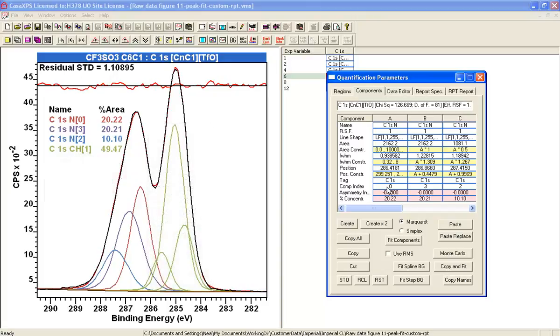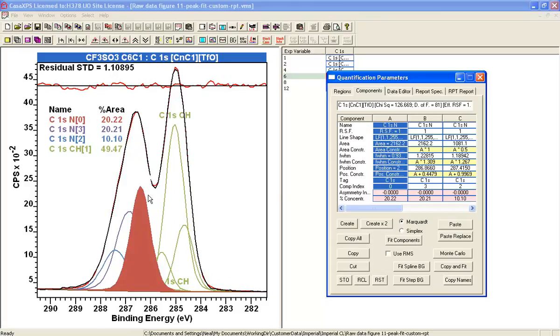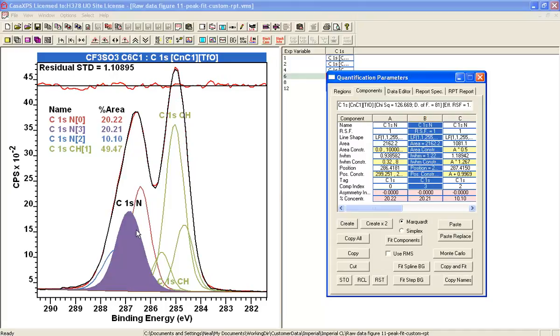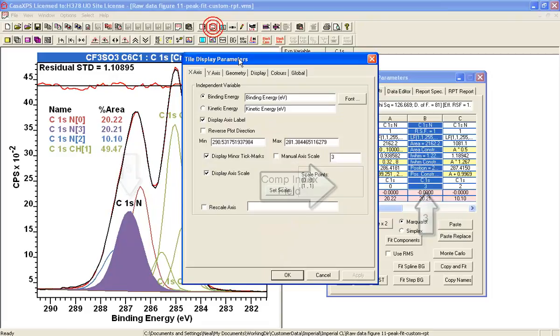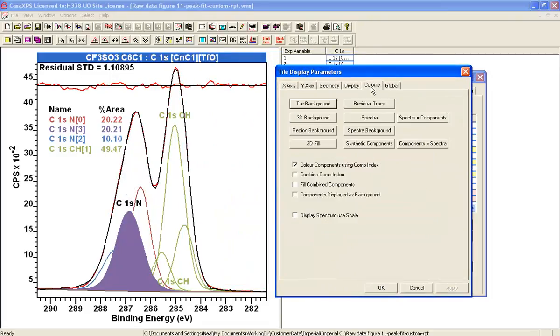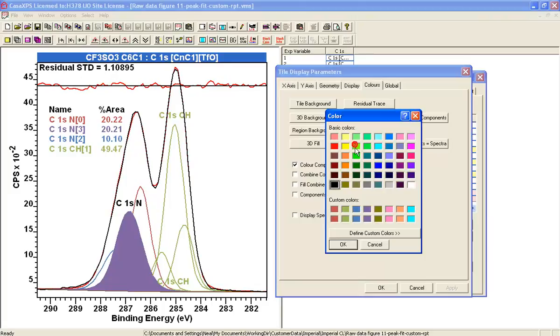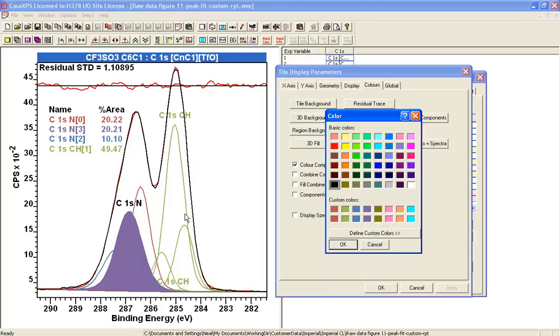So it goes 0, and if I click on this one, you can see this is the 0 peak, and then that's assigned 3. The color that appears here is associated with a table on the color property page for the synthetic components — going 0, 1, 2, 3. Hence we see this mauve color being used to draw this carbon bonded to nitrogen peak, and similarly the 0 one was used to draw this first one.